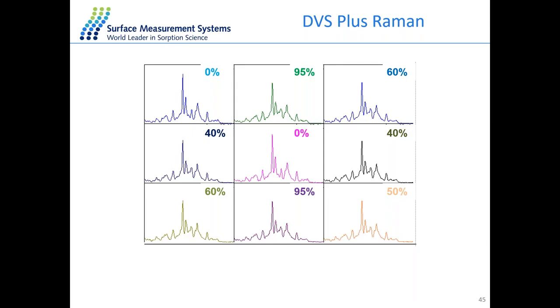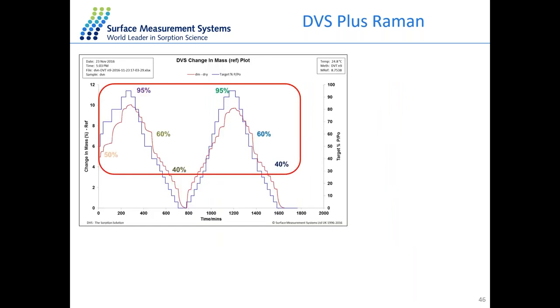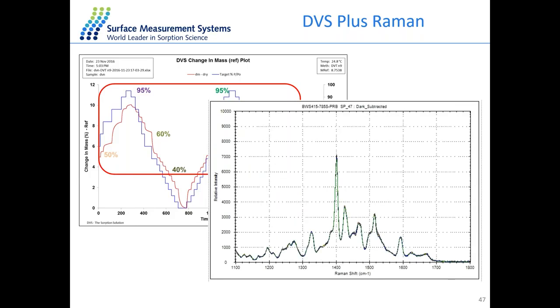So for this specific sample of full material, what we notice, for example, is the fact that whenever we look at the spectra of the material that contains water over 40%, the Raman data are perfectly overlapping, covering exactly the same point, same intensity, same position of the peak.